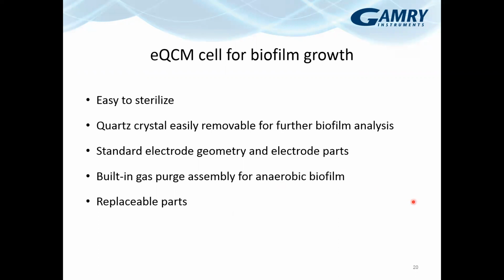for biofilm growth. One, it has to be easy to sterilize. If it's not, you'll spend most of your time battling contamination. And that's a real challenge for students, especially people who are learning to use a system. You want the quartz crystal to be easily removable because chances are you want to send your biofilm for sampling, whether it's imaging or some kind of biochemical analysis.